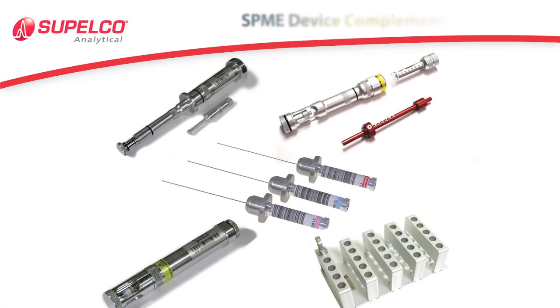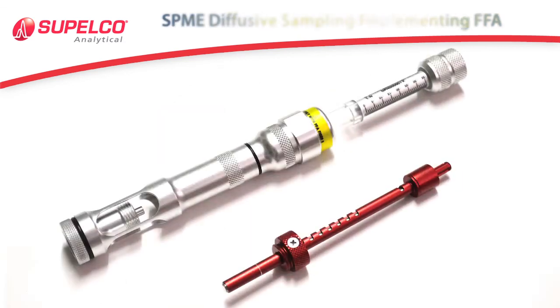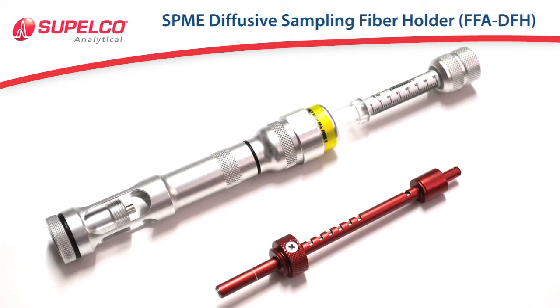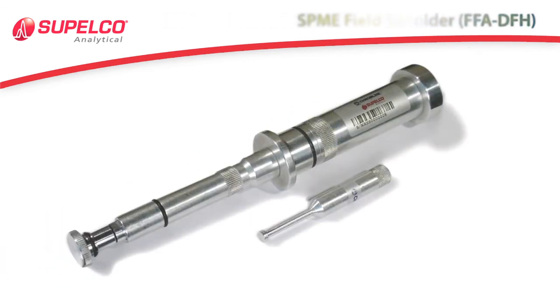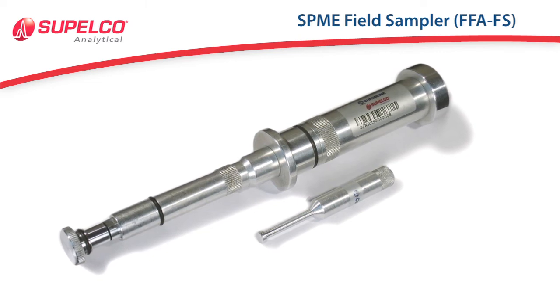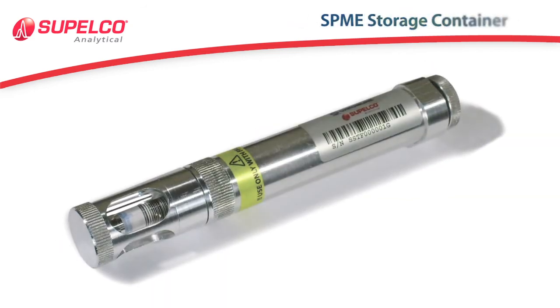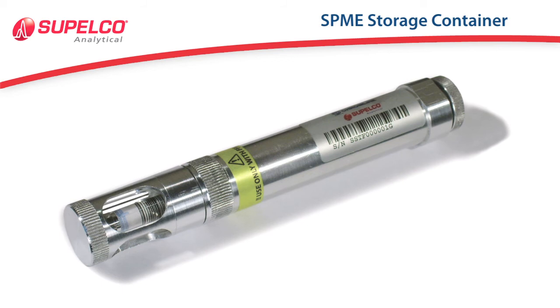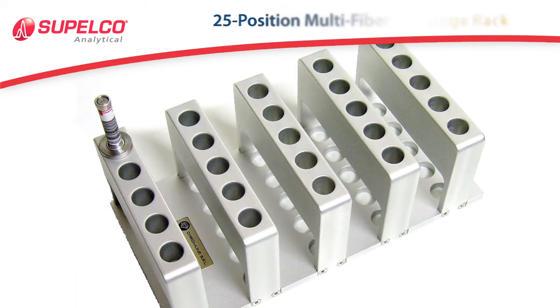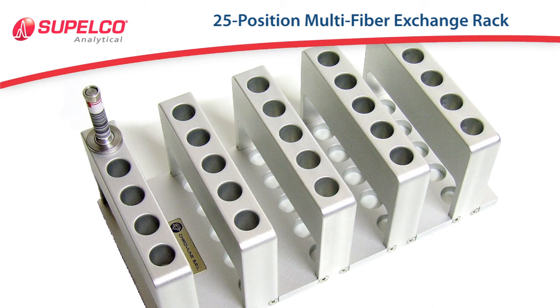The Fast Fit fiber assemblies are complemented by a range of related devices and accessories. These include the SPME diffusive sampling fiber holder (FFA-DFH), useful for time-weighted average air sampling; the SPME field sampler (FFA-FS), which contains a built-in sealing mechanism to ensure fiber integrity before and after sampling; the SPME storage container (SPME-SC), ideal for storing or shipping fibers to and from sampling sites; and the optional 25-position rack multi-fiber exchanger (MFX) for use in the Gerstl auto-sampler.